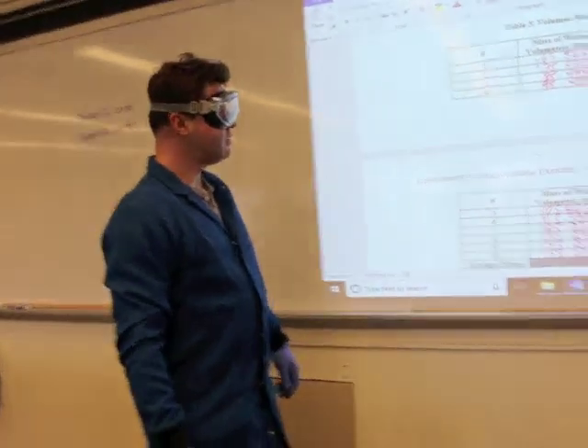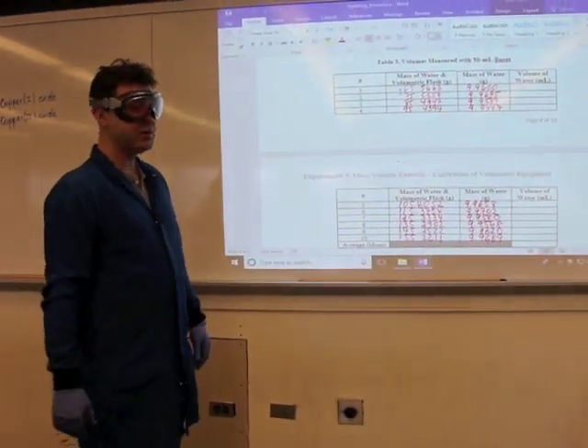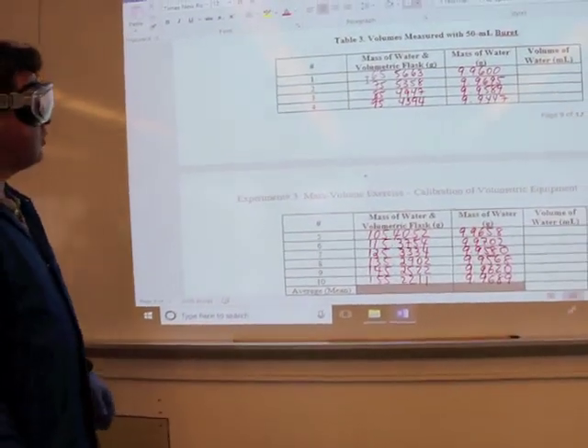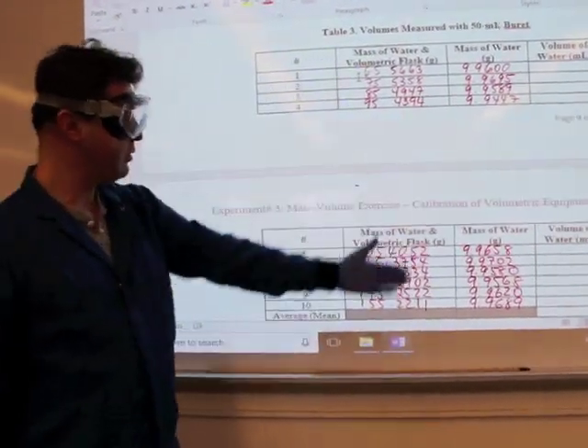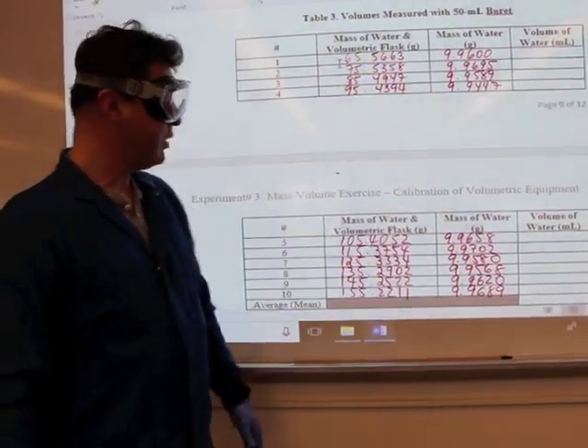I executed the same procedure nine more times with the burette and obtained 10 data points.